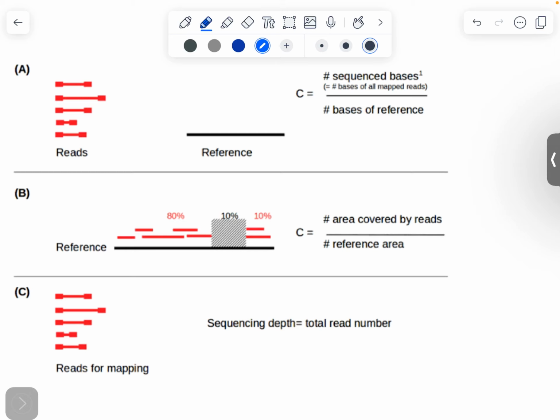If a nucleotide is present in all the reads, this area has a high depth. When you go to the 3 prime end, where only one read extends, suppose there is a nucleotide T, you could say that this area of the genome has a low depth. So depth is in terms of the nucleotides present on the reads against the reference genome.